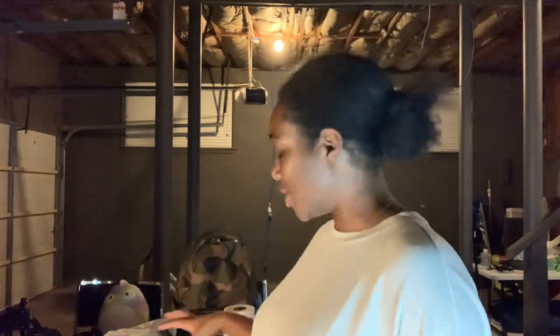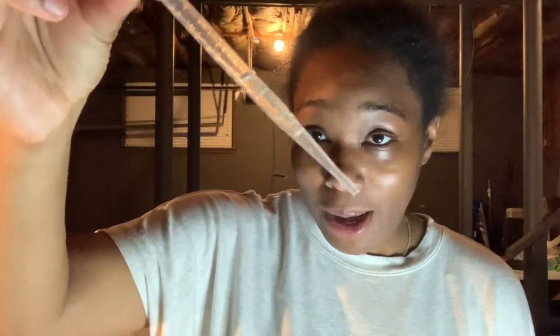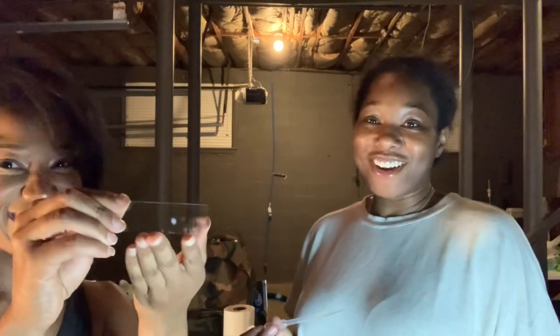Hi guys! It's me and my friend Sydney here. Today we're going to do a little bit of a science experiment with the cucumber. My cucumbers that I grew in the garden have kind of been fermenting a little bit, and I just pulled some cucumber juice in the pipette, as you can see here. We're going to put it on the slide — Sydney's going to show you. We're going to put it on here and then put it on the microscope, and then we'll show you what it looks like, so stay tuned.